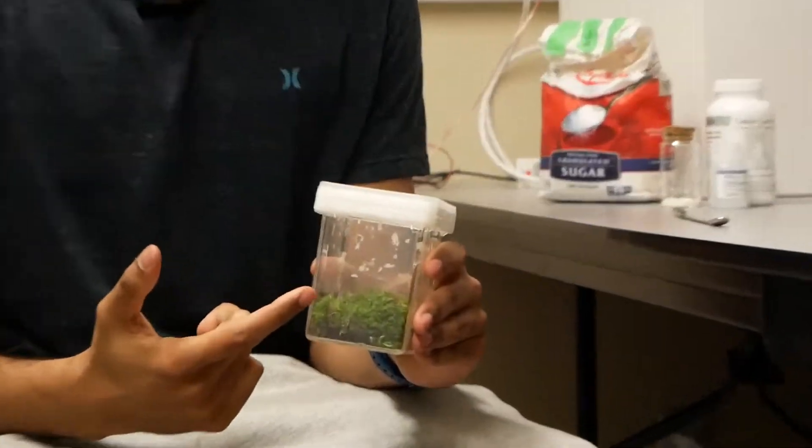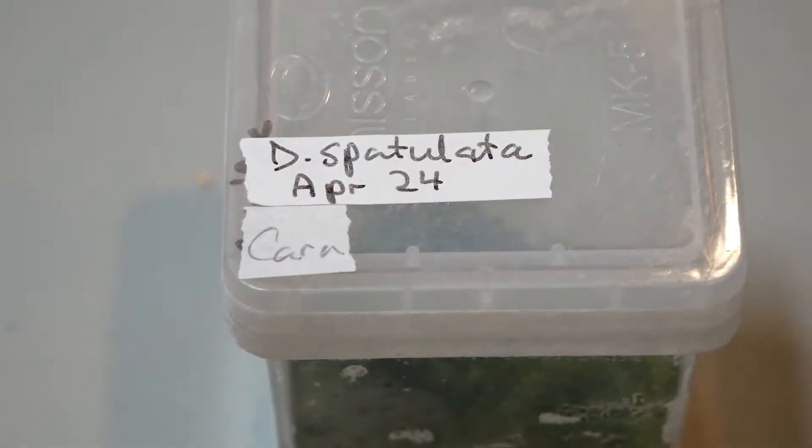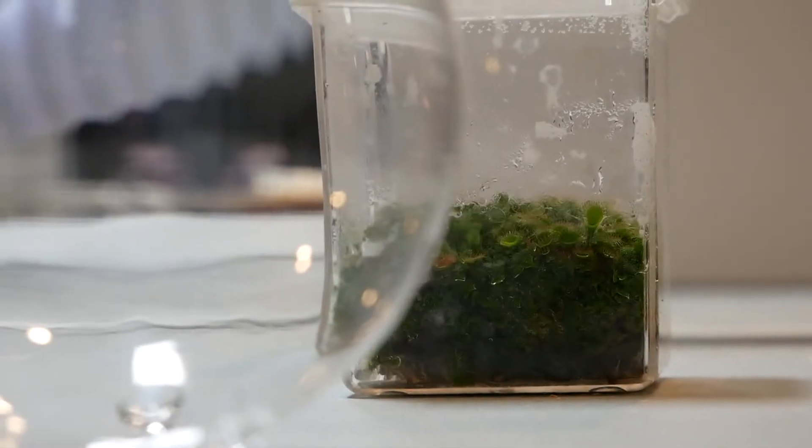This is the actual plant material that we got from Dennis Zhu. He donated it graciously to the STEAM project so we could run these trials, and it's called Drosera Spatulata.